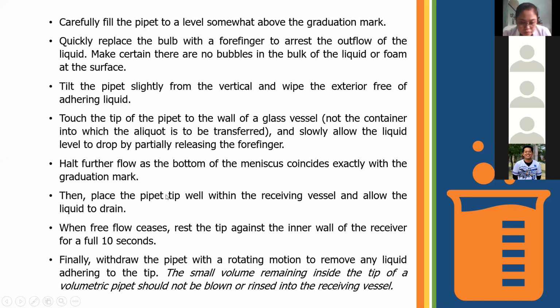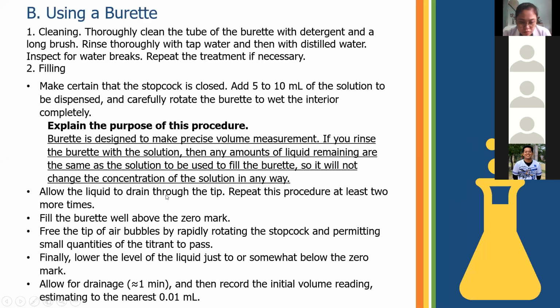Mo, next. So next is using a burette. So first, cleaning the burette. Thoroughly clean the tube of the burette with detergent and a long brush. Rinse thoroughly with tap water and then with distilled water. Inspect for water breaks. If necessary, repeat the treatment.